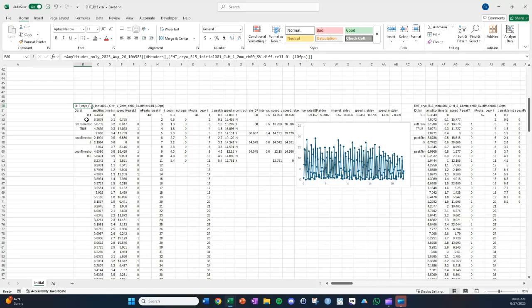Yeah, all of the videos I've taken here are 10 frames per second, and so the delta t here is 0.1 for this and all other videos. These other parameters, so I guess you could call this one parameter and another parameter. The third and fourth parameters I typically adjust for at least a couple videos out of, if I'm analyzing 10 videos, I might need to adjust these in half of them.